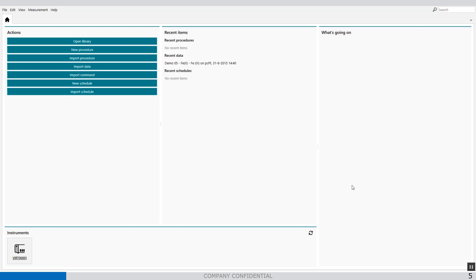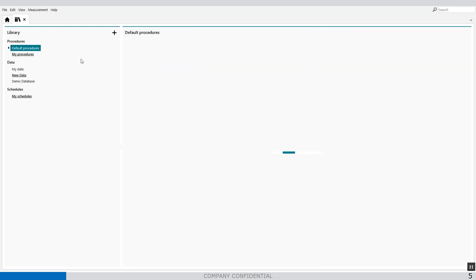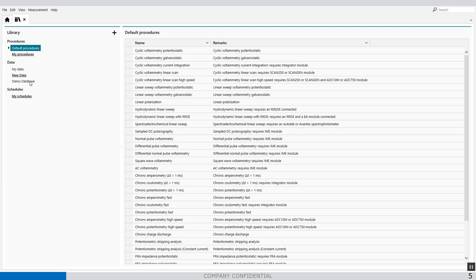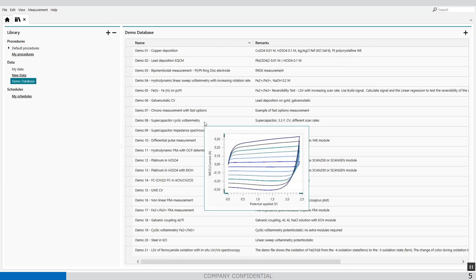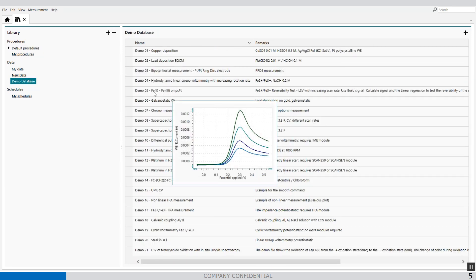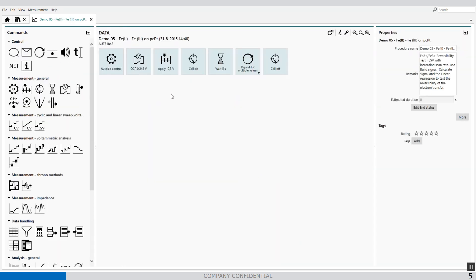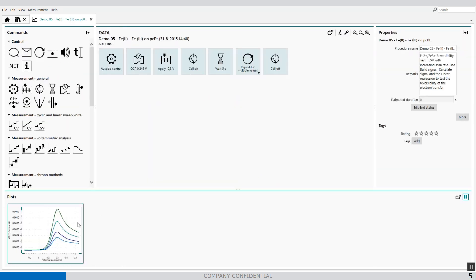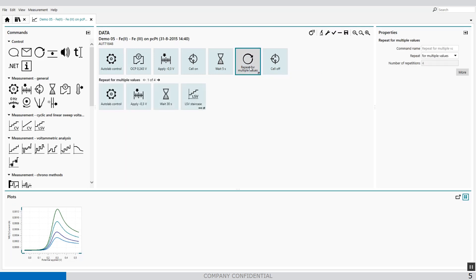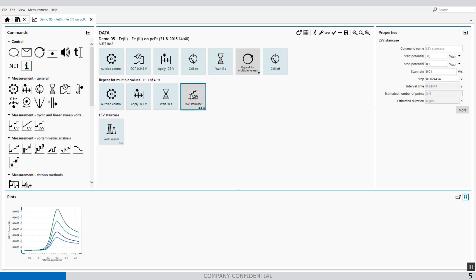Welcome to NOVA software. First we have to open demo data file 05. We go to the library, select the demo database, and in the demo database we will find demo05. In demo05 we will find a linear sweep full time tree, which is repeated with different scan rates. In the LSV there is automatically programmed the peak search.